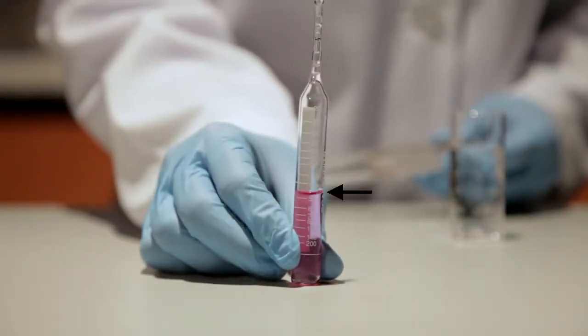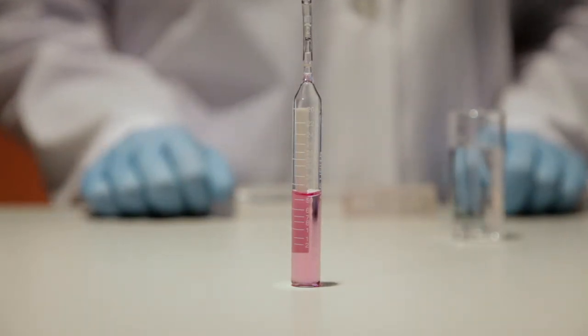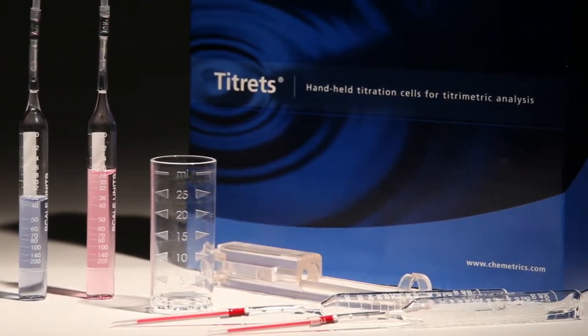Hold the ampoule in a vertical position and read the scale opposite the liquid level. Results are expressed in ppm, milligrams per liter, as calcium carbonate. Titretes kits include everything needed to perform 30 tests.